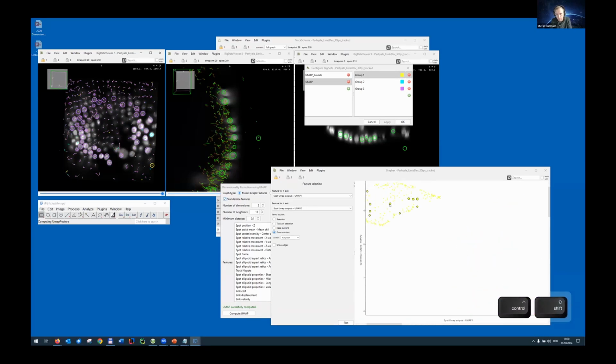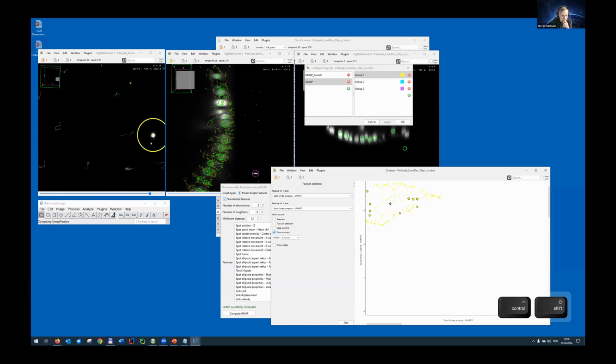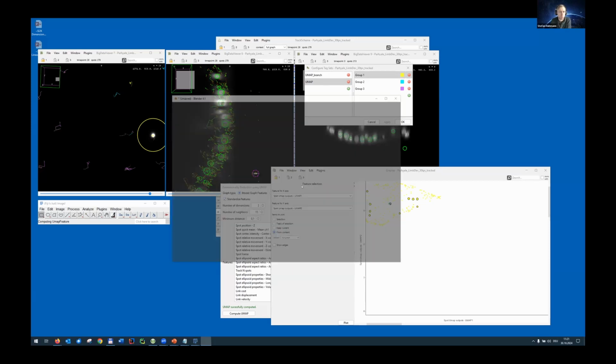I will zoom a little bit in so that I can select individual ones. And yeah, you can see here already that these kind of spots, they are not actually cells, but these are the so-called beads, and the beads are actually needed in light sheet microscopy to register images that have been acquired with a light sheet microscope from different angles. And that's maybe something that you would like to get rid of. And with this analysis, particularly when it comes to producing visualization for publication, then it would be interesting not to have them. And I will show the result also.